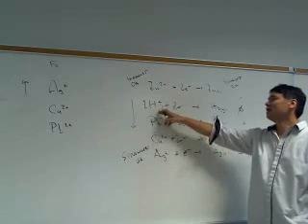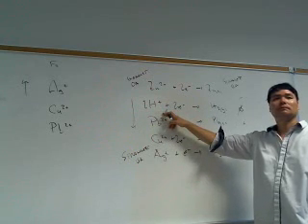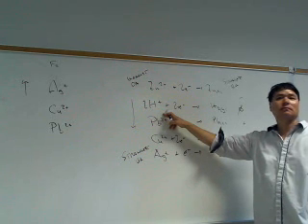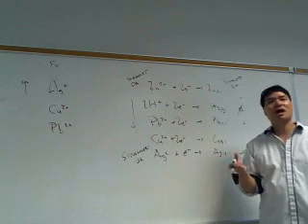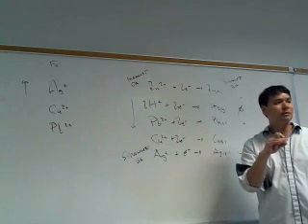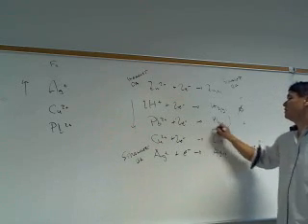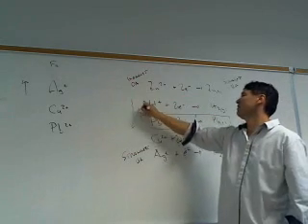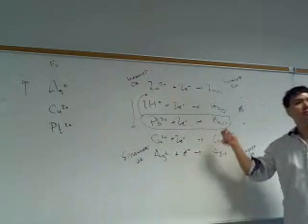Did you get a reaction between H plus and lead metal? No? You got no reaction? What should happen is you should have gotten a reaction here. A white precipitate should have formed on the surface. And so the reason is this. There was a reaction here, so that means this is out of place. That's what you're saying. This is out of place.